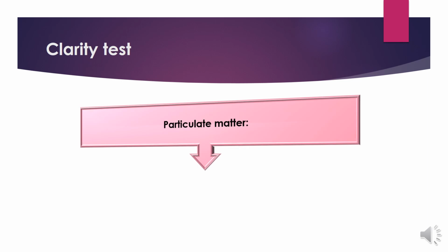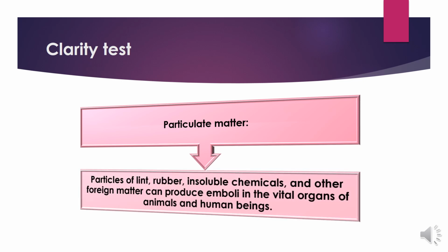So the various particulate matter or particles that can have possible entry into the parenteral preparation include particles of lint, rubber, insoluble chemicals, and other foreign material.